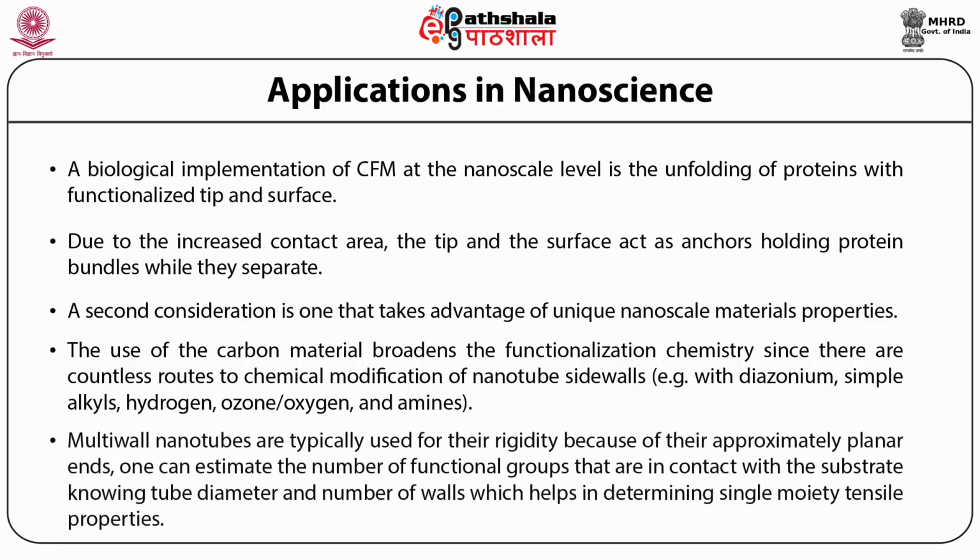Multi-wall nanotubes are typically used for their rigidity. Because of their approximately planar ends, one can estimate the number of functional groups that are in contact with the substrate, knowing tube diameter and number of walls, which help in determining single moiety tensile property. Certainly, this method has obvious implications in tribology as well.